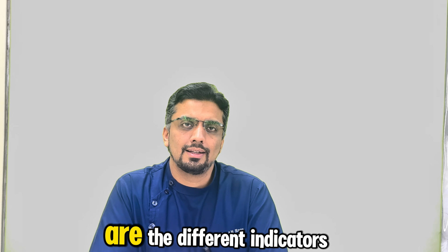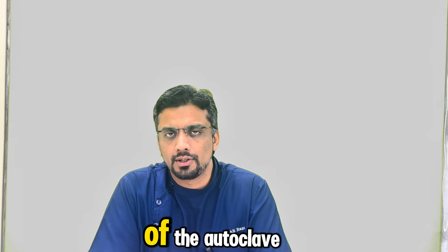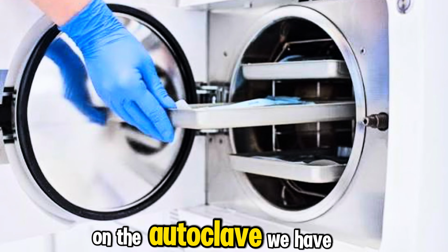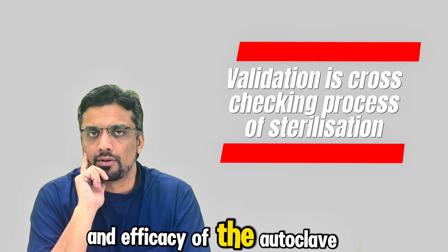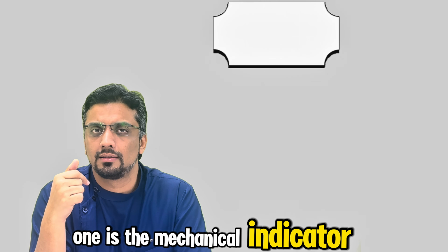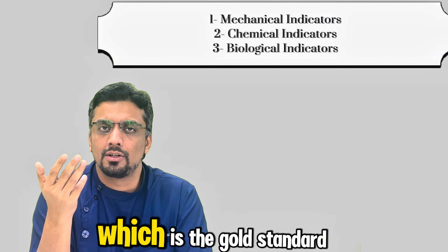We will talk about what the different indicators are and what the validation of the autoclave involves. We are not completely blindly trusting the autoclave. We have to have certain parameters and indicators to cross-check the process of sterilization and the efficacy of the autoclave. There are three means and indicators. One is the mechanical indicator, second is the chemical indicator, and third is the biological indicator, which is the gold standard.